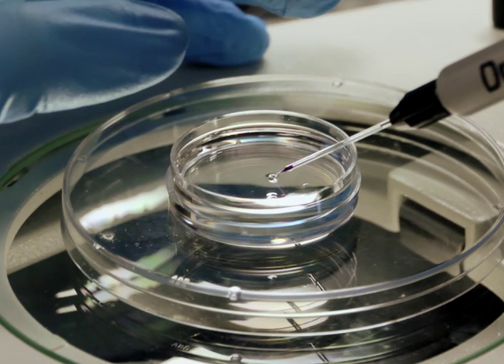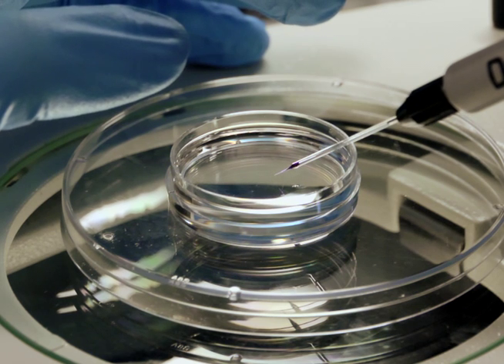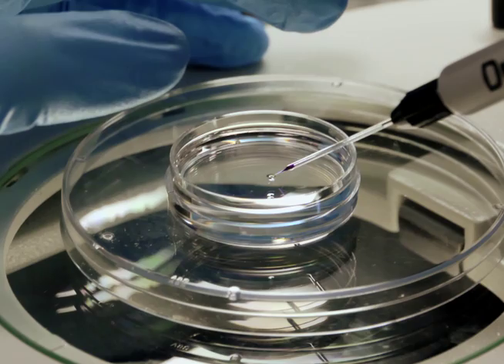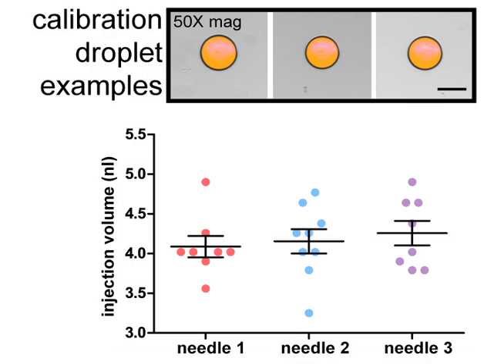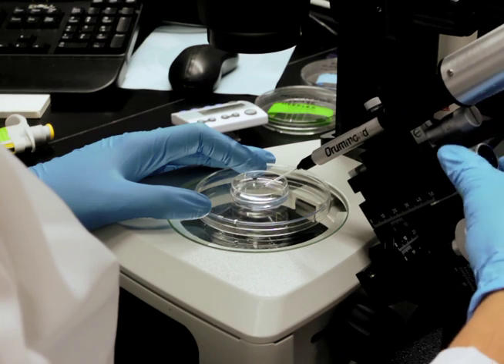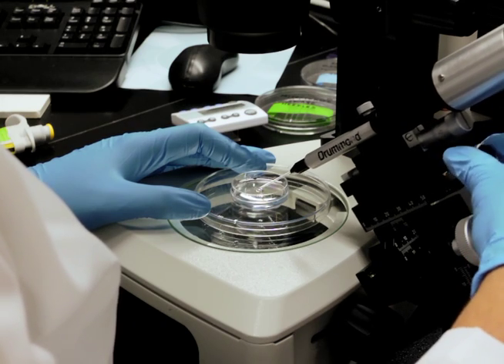To calibrate the ejection volume, inject small droplets into a small petri dish filled with mineral oil until they are consistent in size. Measure the diameter of the droplets using the graticule and calculate the droplet volume. Before using the needle for gavage, remove any residual mineral oil by rinsing in clean zebrafish media.